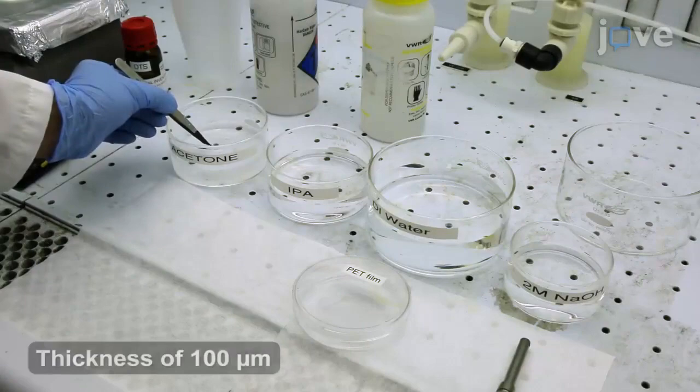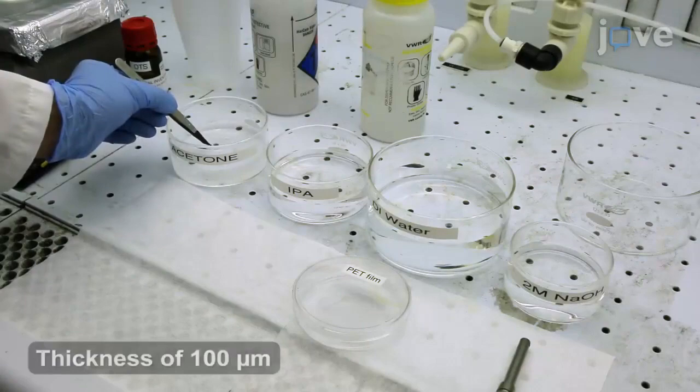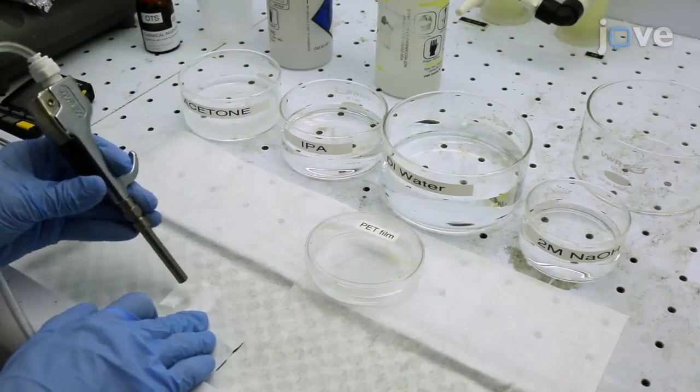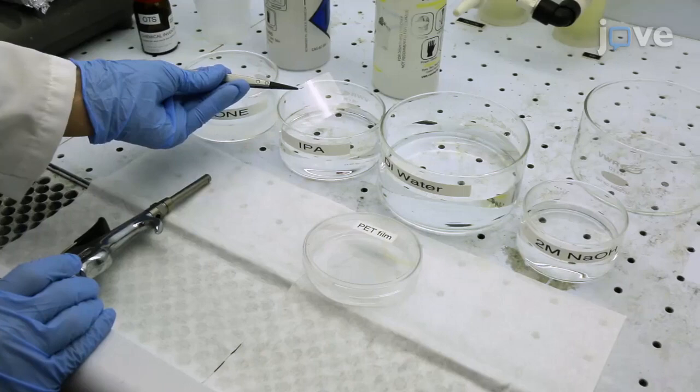Clean the surface with polyethylene terephthalate, or PET, film with 99.8% acetone for 5 minutes, followed by 99.9% isopropyl alcohol for 5 minutes.